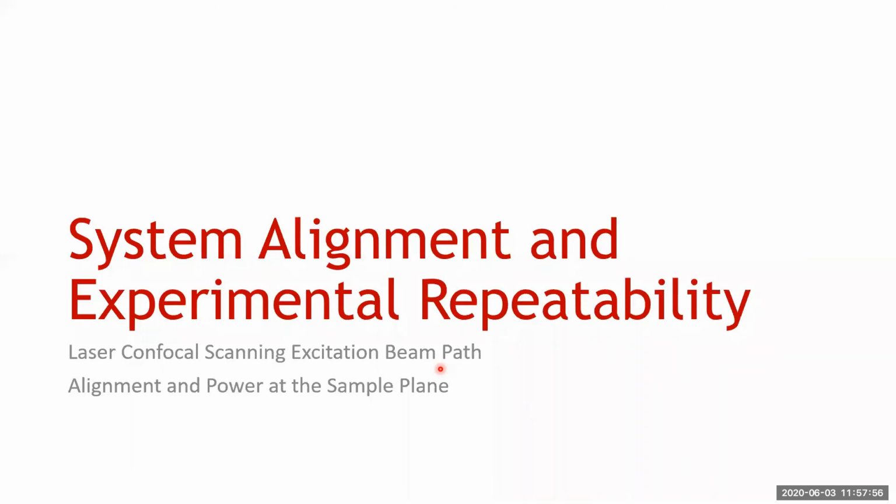Now, you're going to slow down your speed by, say, increasing your pixel dwell so that you get more counts for each pixel, raising it to, let's say, 200 counts per pixel of interest. It's going to slow down everything, but now your dynamic range is improved, staying at 8-bit still, and you're going to be able to discriminate your objects and your background.